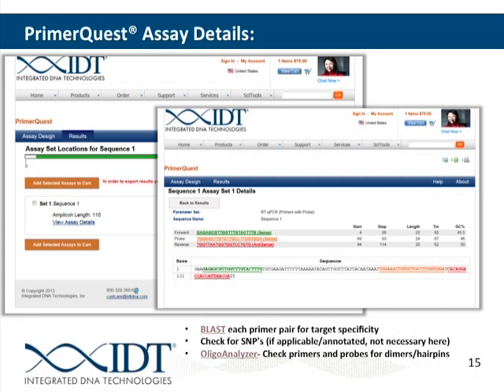And then from here, you can scroll through to see what's similar, what's different about these sequences, try to get an idea of regions to design to, and download the alignment file as a Word file.